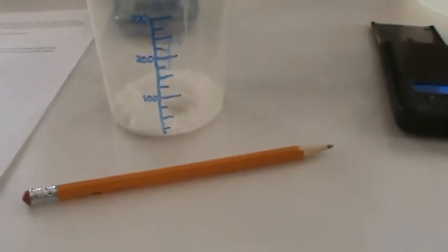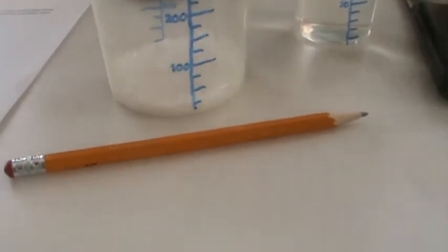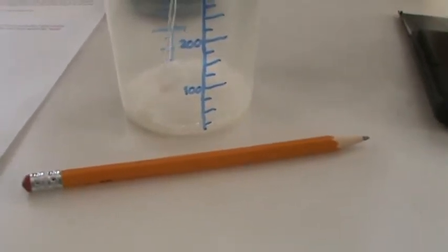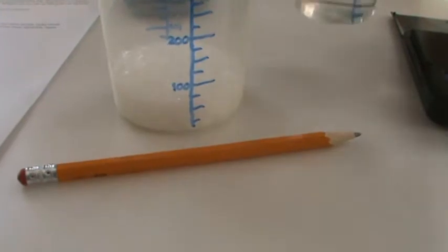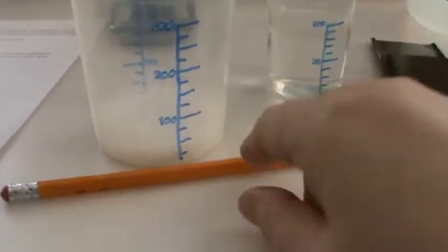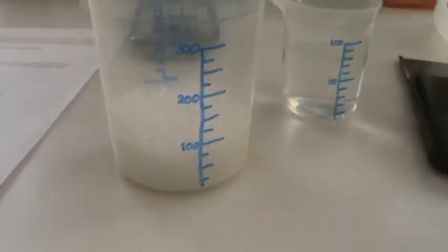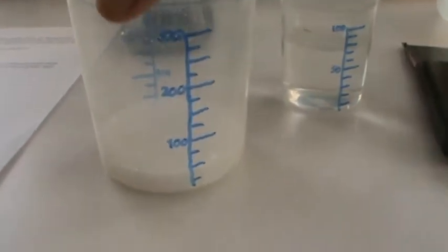Now what I'm going to do is we're going to watch this. If you've ever seen kids making volcanoes in elementary school, this is what it is. So we have to do this slowly so that we don't make a big mess. And some of it's so that we don't make a big mess, but some of it also is because if it overflows, we'll lose a portion of it. Which is why it's okay that I can't pour all this in at once anyway.